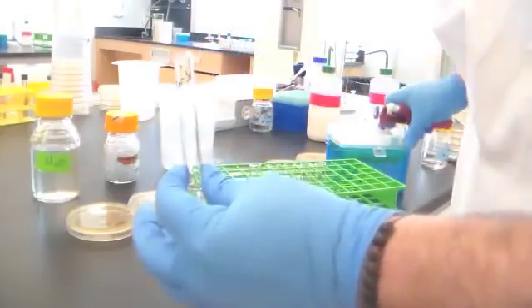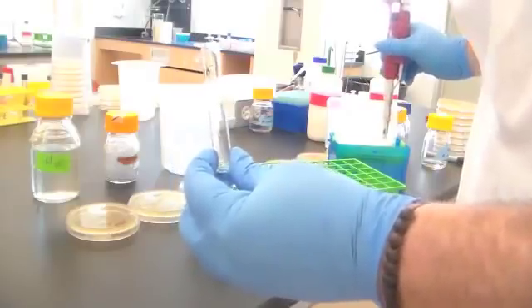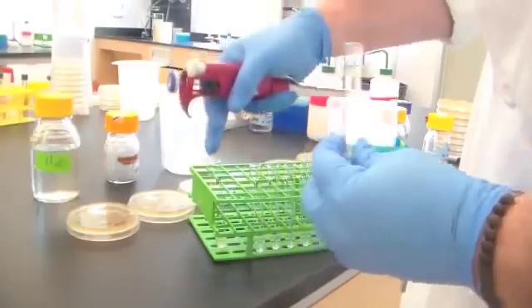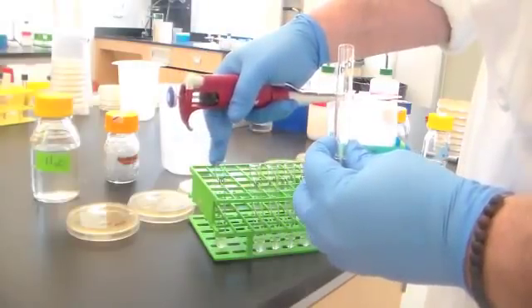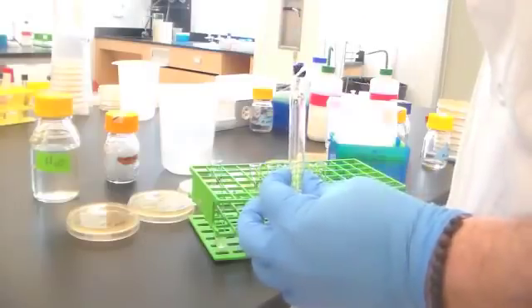That's my 1 to 100 dilution, or 10 to the minus 2. So if there were 10 million bacteria in the original culture, there were 1 million per mil in the 10 to the minus 1. There are now 100,000 per mil in this culture.